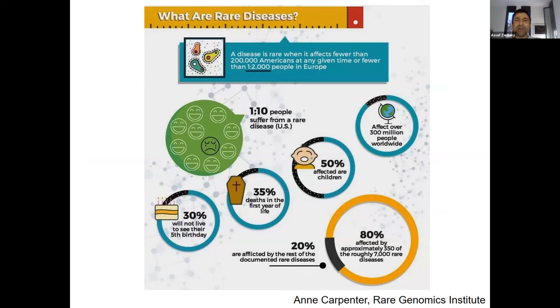One example is also rare diseases, where you need a cheap and easy assay. Drug companies, some of them do put money in that, but some of the diseases are really, really rare, and it's not worth putting a lot of research and development effort. But in this case, cell profiling can actually provide a solution. I know a few examples of very rare diseases where people took the cells from the patient, and then they screened for drugs that make the cells look more similar to healthy cells. So in principle, you can do personalized drug targeting within that.